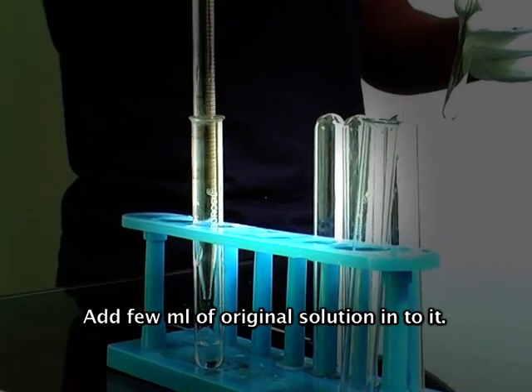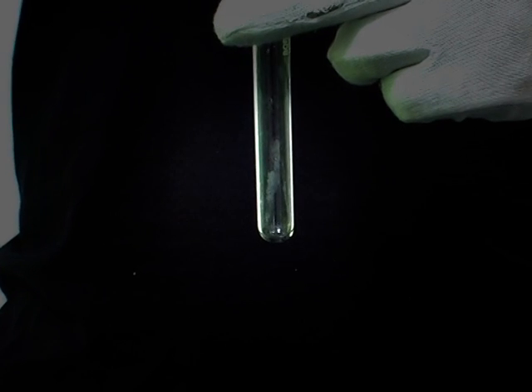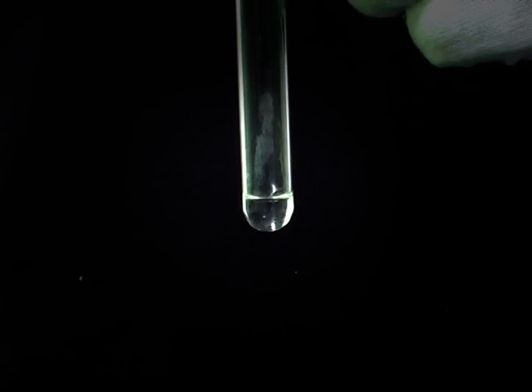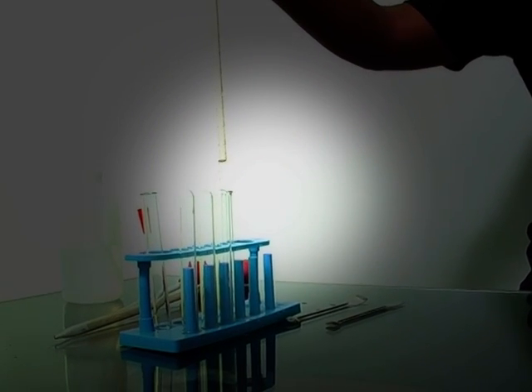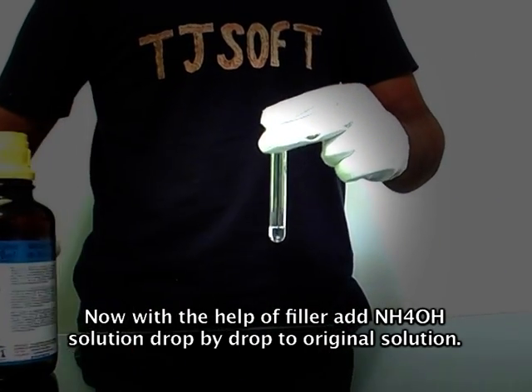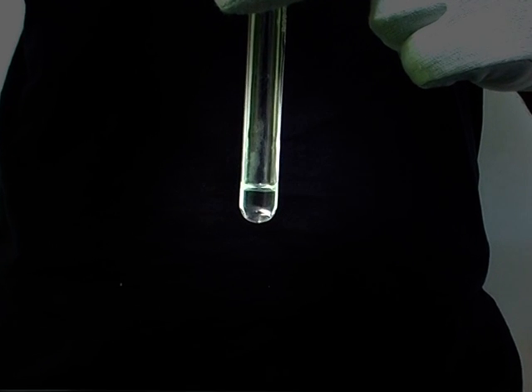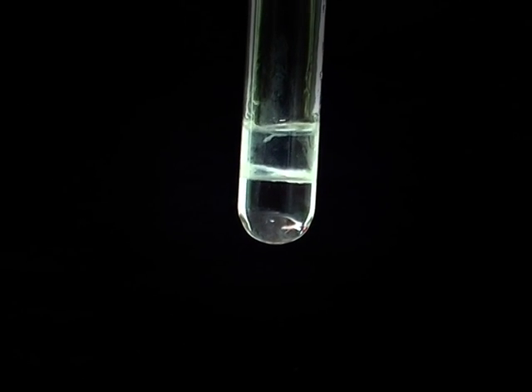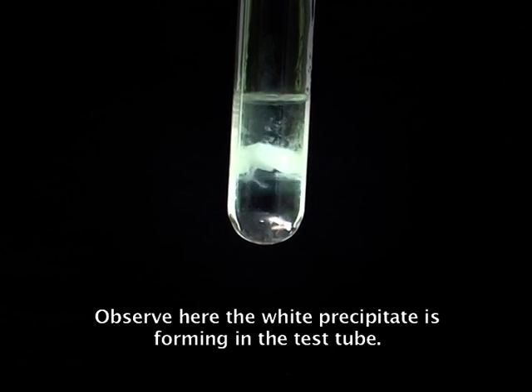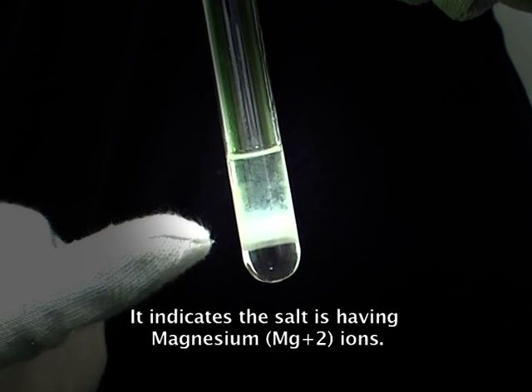Take another test tube and add few ml of original solution into it. Now with the help of a filler, add ammonium hydroxide solution drop by drop to the original solution. Observe here the white precipitate is forming in the test tube. It indicates that the salt is having magnesium ions.